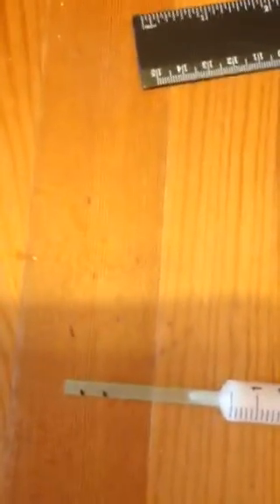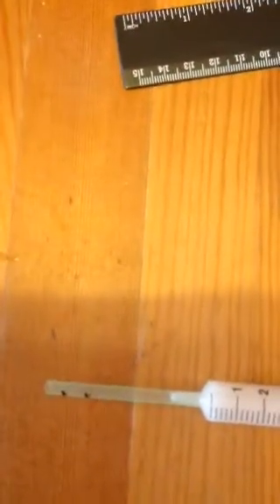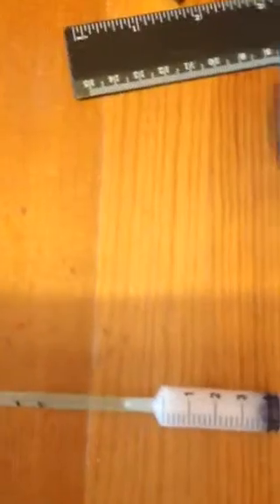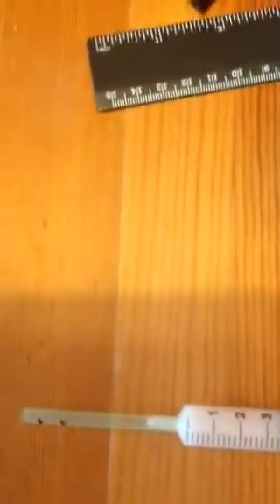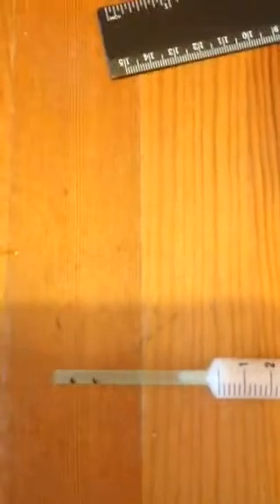Once they've timed how long it takes to move that particular distance, all they need to do is 1 divided by that time to get a rate of reaction. It works as a beautiful bell-shaped curve for 0, 10, 20, 30, 40, and 70 degrees, giving you an effective temperature curve with the peak between 30 and 40 degrees. It also works with sugar — if you have no sugar you get no reaction, and too much sugar kills off your yeast.